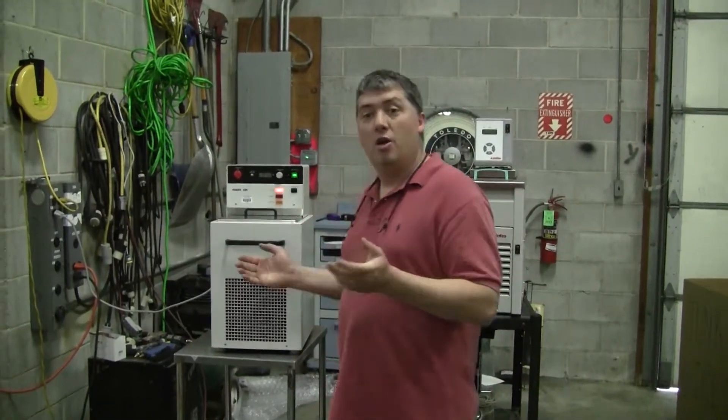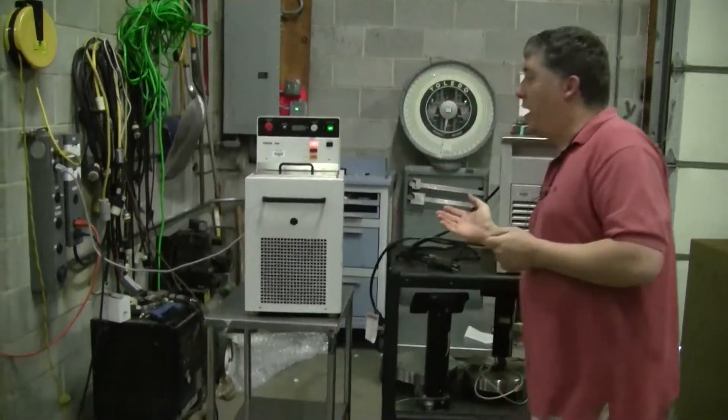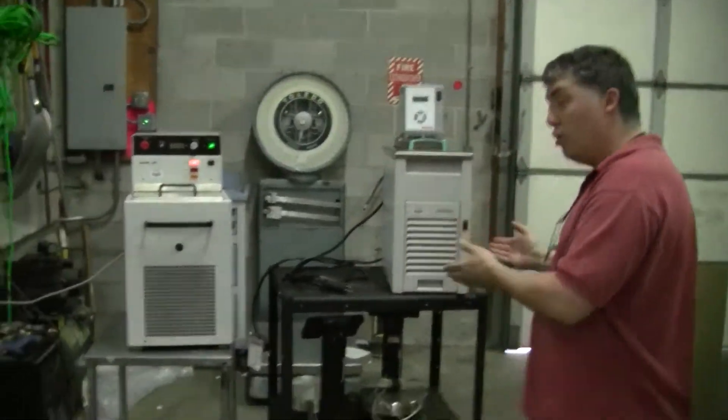Hi, this is Michael Natow from Hitechtrader.com. Today I'd like to talk to you a little bit about lab scale recirculating chillers. At Hitechtrader we can do service, and we can sell you used equipment.